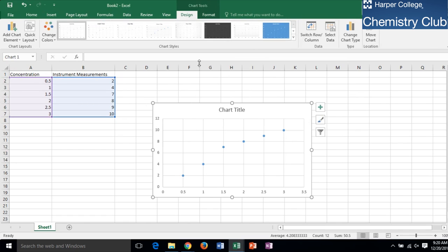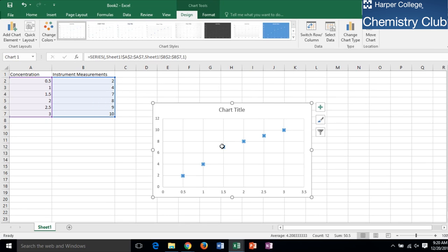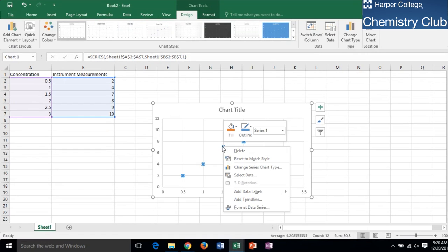To add the computer generated curve to the graph, left click on one of the points. This will select them all. Then right click on the point. A menu will appear. Choose Add Trendline.